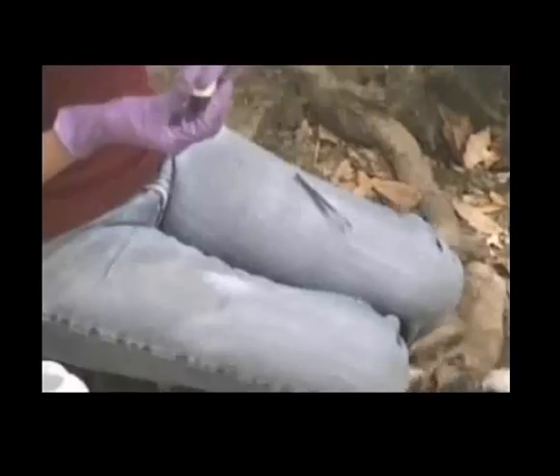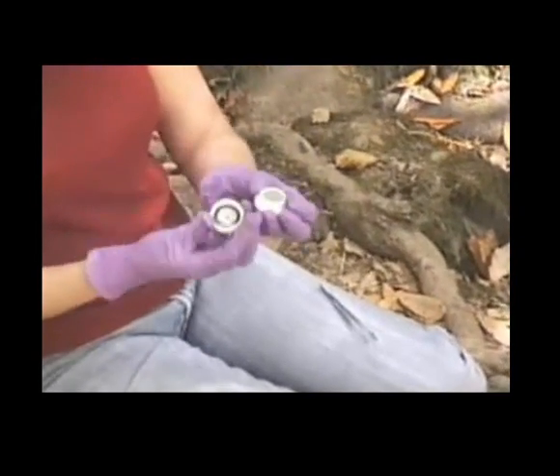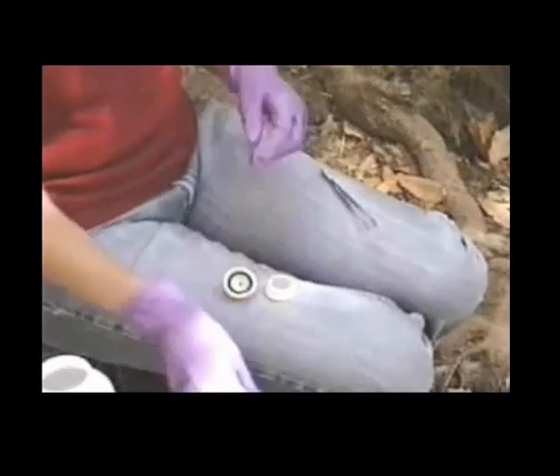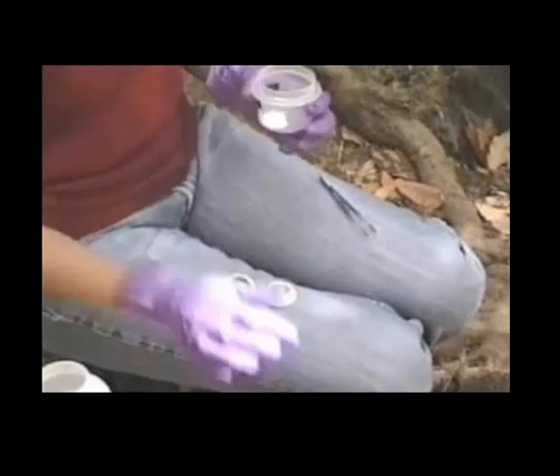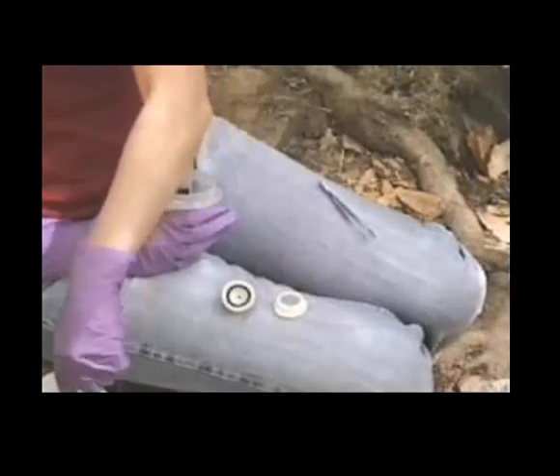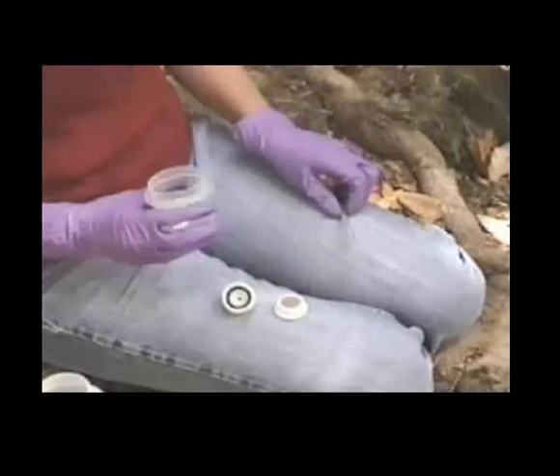This is the filter holder. Comes undone. There's an O-ring that you want to be aware of. It's helpful to get the filter a little bit wet. Helps the filter stick to it a little bit better.